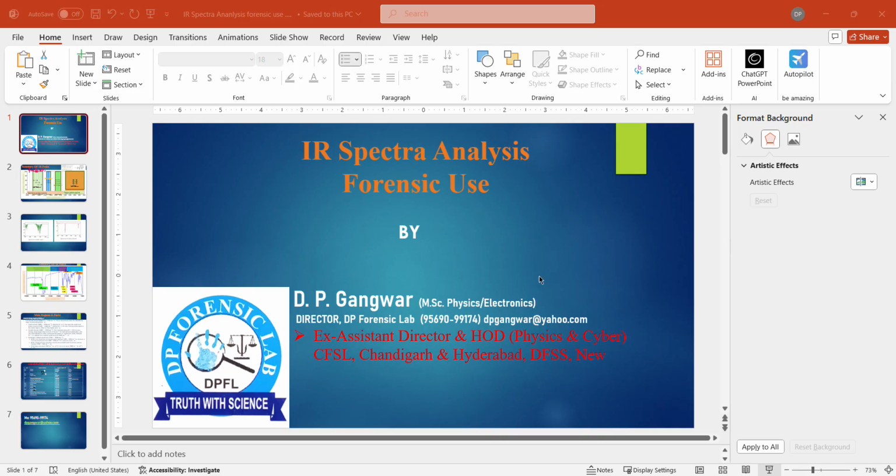Another is the hydrogen-related stretching, as we saw in the previous slide, from 2500 to 3600 centimeter inverse. The OH comes in this category, with a very broad and strong absorption at 3200 to 3600 centimeter inverse for alcohols, or a strong broad band from 2500 to 3300 centimeter inverse for carboxylic acids.